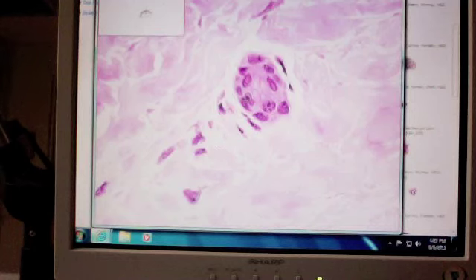This epithelium represents what tissue of a gland. Now, if you said duct, I'd probably say, yeah, fine, because it is a duct, okay, but the tissue is really the parenchyma, which is the epithelial tissue. What other part is there besides the parenchyma?